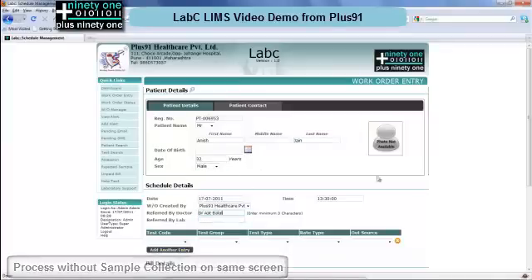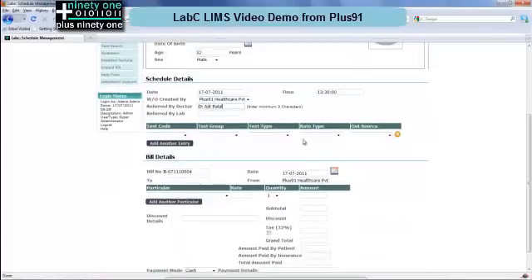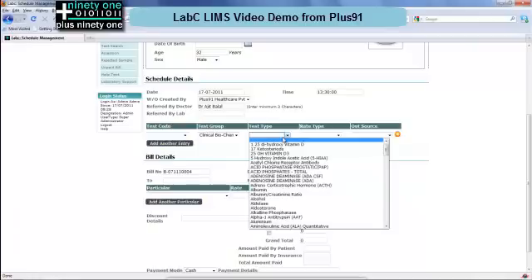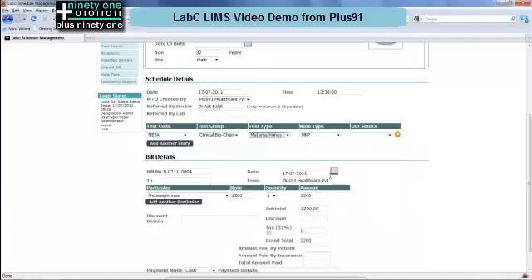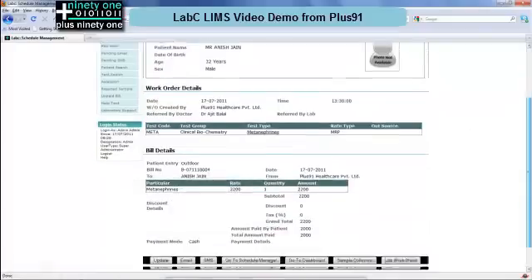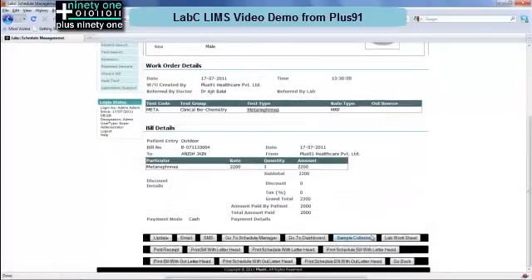You enter the demographic details and select the doctor. You can select the test and also select whether the test should be outsourced to another lab, in case it is not done at your lab but you send the sample to a second lab. After that you can add the billing details. The bill is also auto-generated from a rate list which you have entered in the system. Again the same options are possible below.